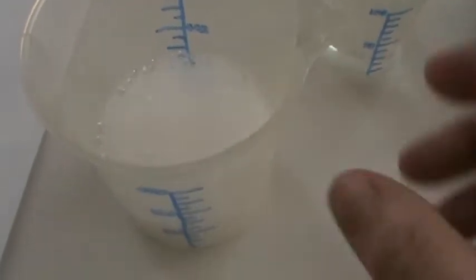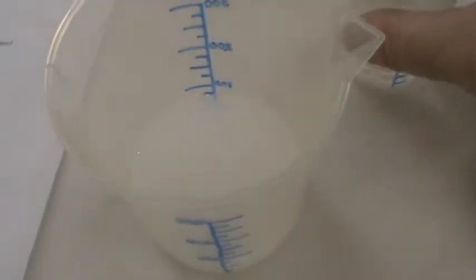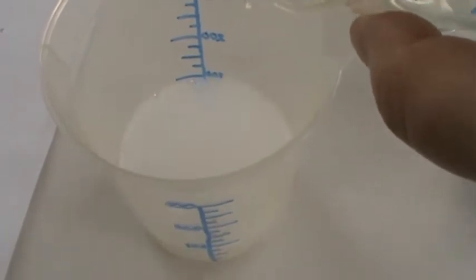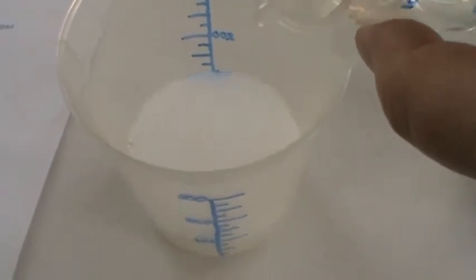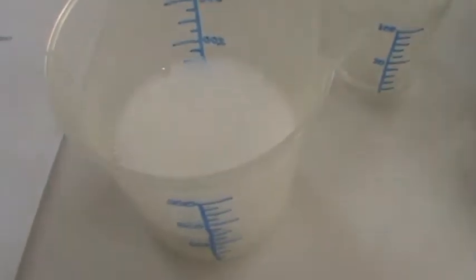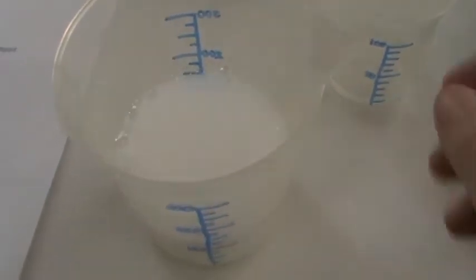You can see how there's no way I could have poured all of the vinegar in here at once, or whoosh, it would have just gone right overflowing. And even now I have to be careful that I don't dump too much in at once.